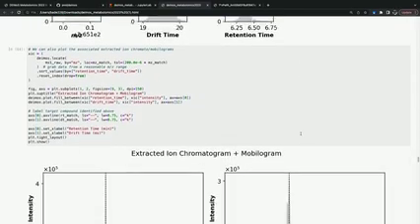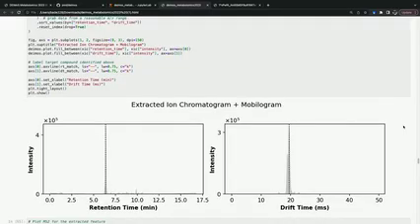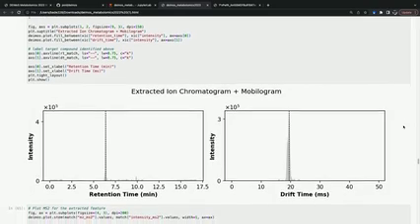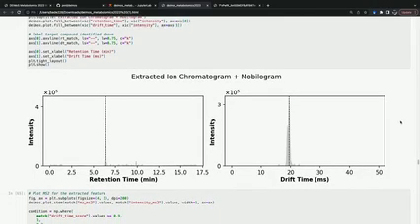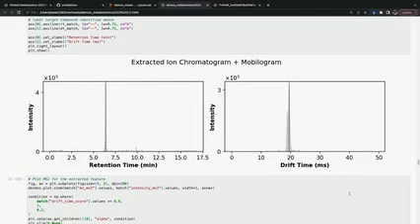And of course, we can plot the extracted ion representations as well. Here, we're reproducing the steps in the total ion, except we're filtering in that m/z space to restrict this to only the signal of interest. The dotted line here represents the feature that was found using DEIMoS' locate function. You can see that corresponds fairly well to the maxima on both of these extracted ion plots.